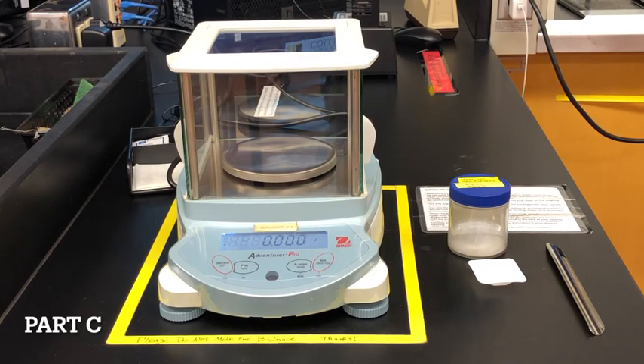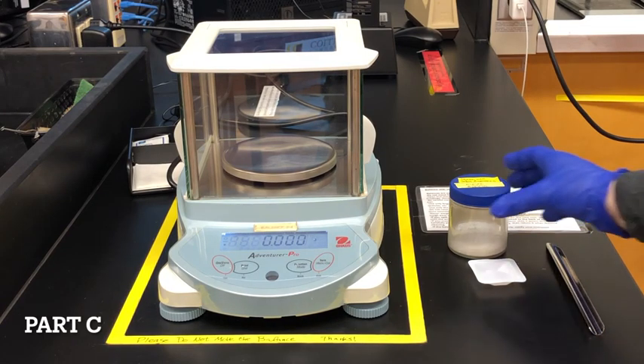In this lab we're going to skip parts A and B to save time and we'll just focus on part C.